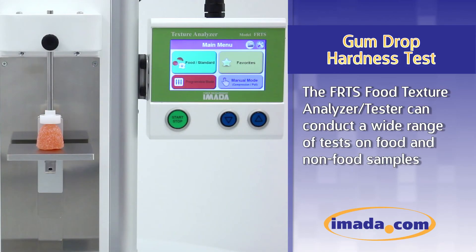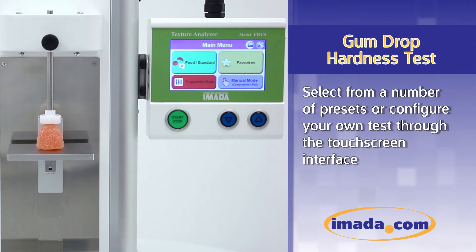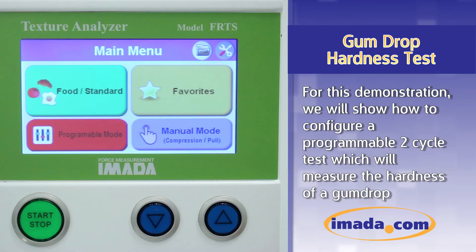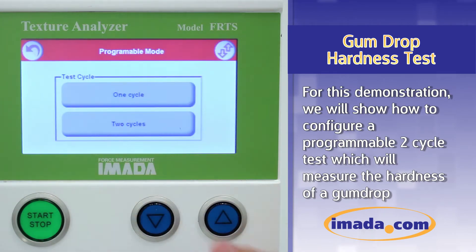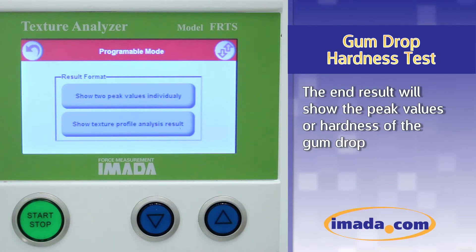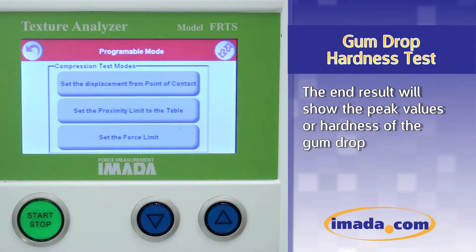The FRTS Food Texture Analyzer can conduct a wide range of tests on food and non-food samples. Select from a number of presets or configure your own test through the touchscreen interface. For this demonstration, we will show how to configure a programmable two-cycle test which will measure the hardness of a gumdrop. The end result will show the peak values or hardness of the gumdrop.